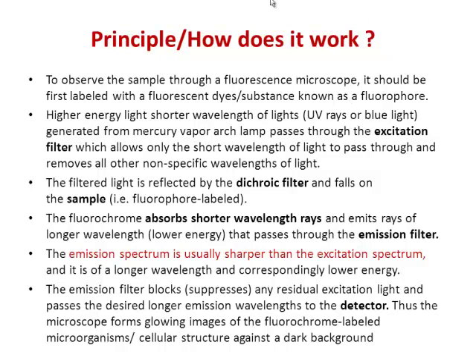Okay, so the principle is that to observe a sample through a fluorescence microscope, it should first be labeled with a fluorescent dye or a substance which is known as the fluorophore.